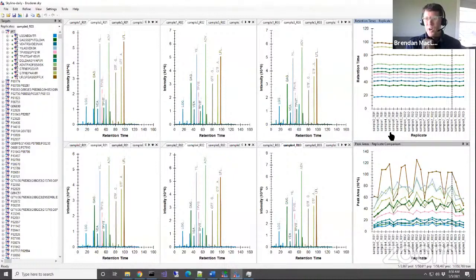So each one of these sets of replicates is its own self-contained experiment. If we had a mass spectrometer problem out here, or in the middle, and then fixed it, we might lose a full set of data and have to go, oh, we only have duplicate instead of triplicate. But if we had measured all the samples the way we had them logically ordered, then we lose subjects.